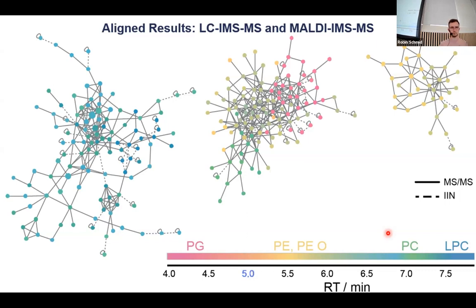That's also why we support the native format, because converting them to mzML really explodes the file size. And I just want to stress, very often with the Q-TOFs and the Orbitrap, with higher resolution mass spectrometry, you can already do all this non-target metabolomics. And then for some compound classes, or maybe for validation, TIMS or IMS in general might be very nice to separate it more and find some new things.